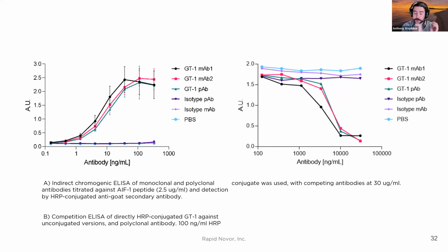So we actually only really observed two monoclonals within the polyclonal mixture, but there was still a polyclonal background. On the flip side, there could be dozens, if not hundreds of antibodies that are present, but really at high concentrations, it's usually no more than a few dozen antibodies that we're able to observe on the mass spec that are, we believe, conferring that functional activity that you're really seeking to recapitulate.